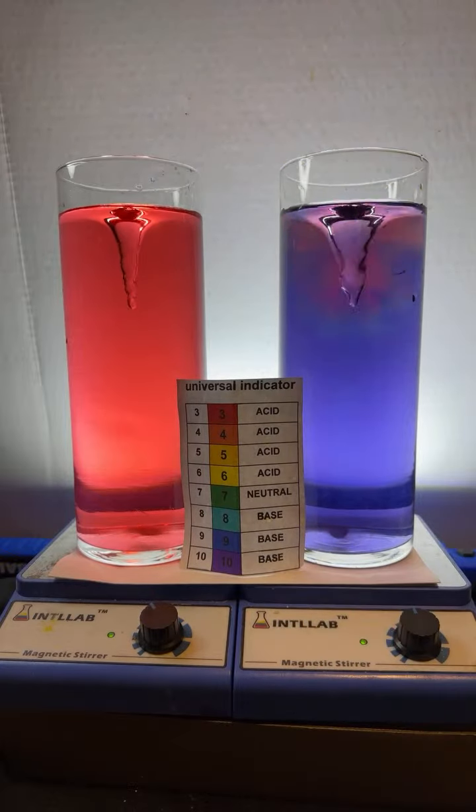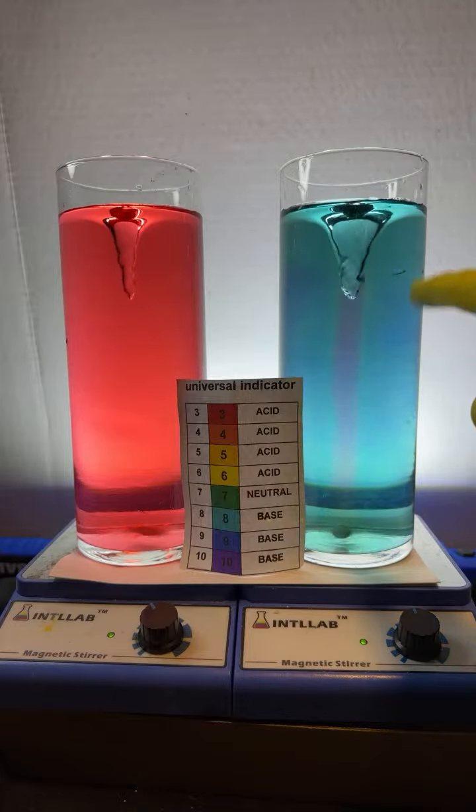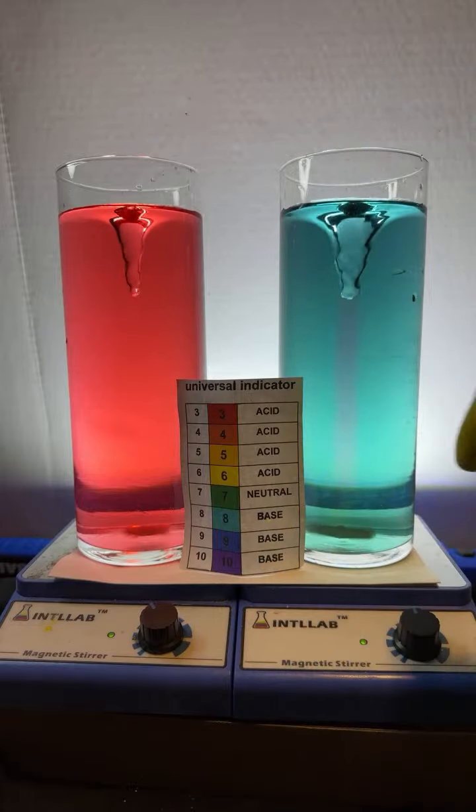All right, in goes a little more acid. Hey, look at that. I've neutralized it, pretty much. I'd say it's pH 8. So we dropped from pH 10 to pH 8 over here on the right.